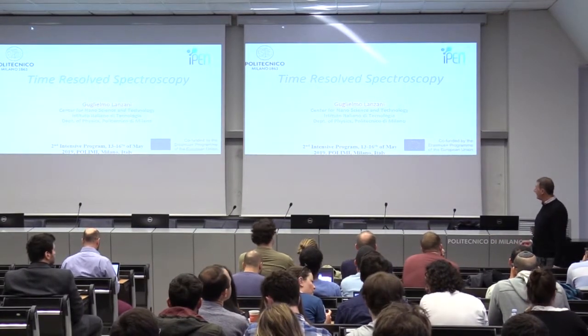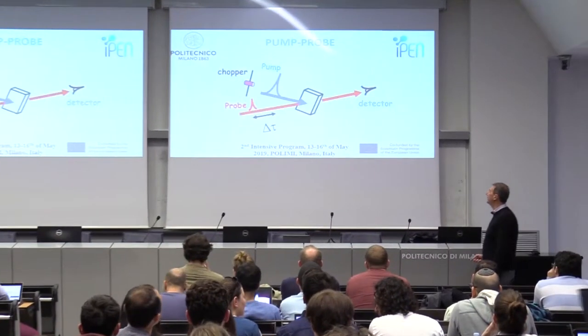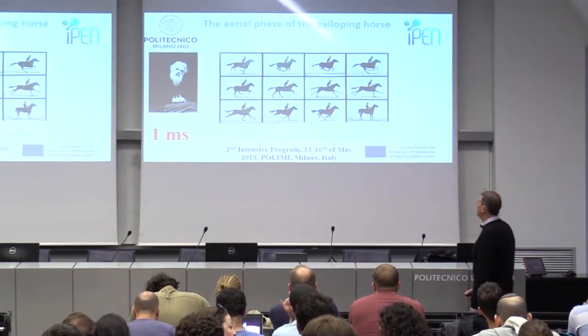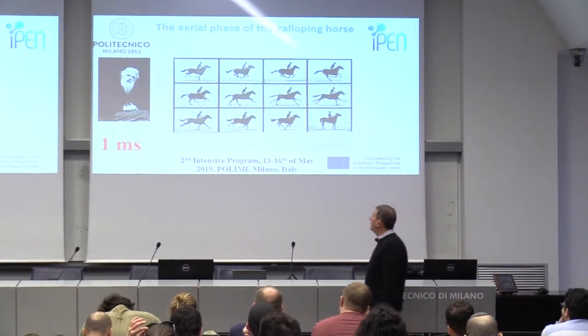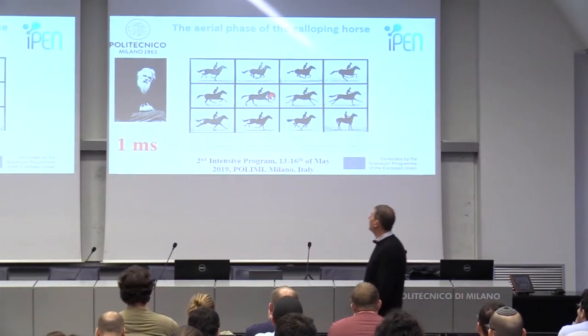The topic of today is pump probe. So I'm going to talk about this technique. It's a basic tutorial, so do not expect any fancy result. I start with some history. So we talk about time resolution, right? So this guy, Muybridge, I think Muybridge, was an expert in photography, and this is the guy.